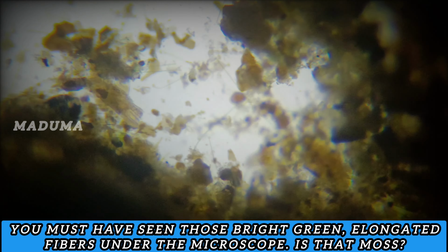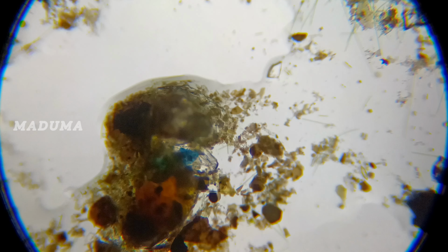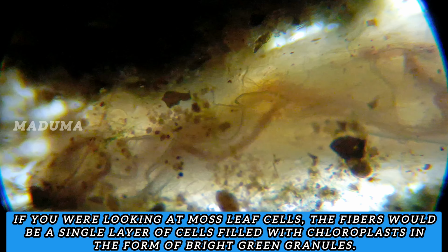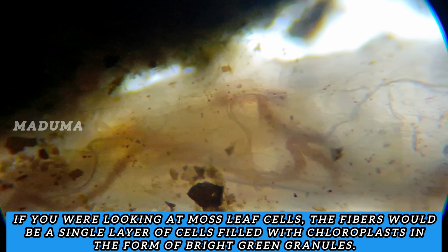Chapter 6. Bright green fibers under the microscope. Is that moss? You must have seen those bright green, elongated fibers under the microscope. Is that moss? If you were looking at moss leaf cells, the fibers would be a single layer of cells filled with chloroplasts in the form of bright green granules.